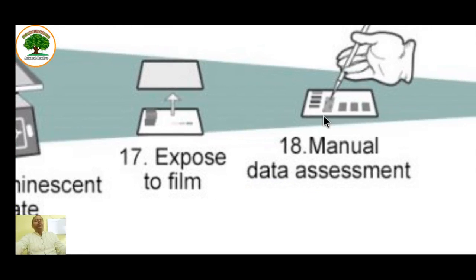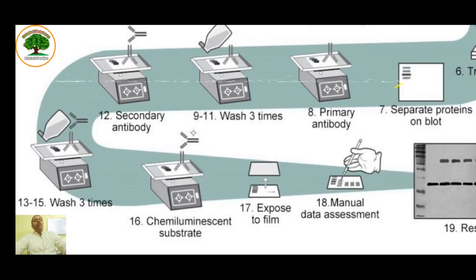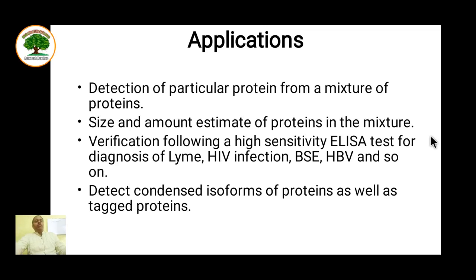Then manual data assessment using the comparison of the gel and the membrane is done, and then you can tell whether the protein you used belongs to a particular family or not, or whether it can be detected in that sample. So there are various applications of this method. Let's see the applications. It is used for detection of particular proteins from a mixture of proteins. You can check whether a protein is produced in an organism or not. Then size and amount of the protein in the mixture can also be estimated. Verification following high sensitivity ELISA tests for diagnosis of Lyme, HIV infection, BSE, HBV, and so on can be done using this. We can detect condensed isoforms of proteins as well as tagged proteins in some organisms.